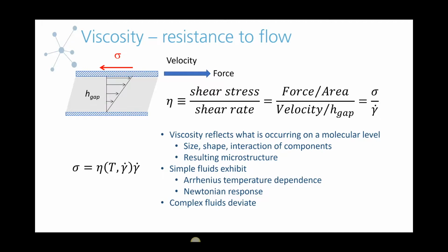And simple fluids, so by simple I mean solvents or your buffer formulation, will have simple behaviors. So for example, as I mentioned, we're going to address temperature dependence of some systems. And for the simple systems, generally you have temperature dependence that follows the Arrhenius law. So the viscosity will just continuously decrease as you increase temperature. And then also the simple fluids tend to have a viscous response that is not dependent on shear rate, or it's Newtonian.